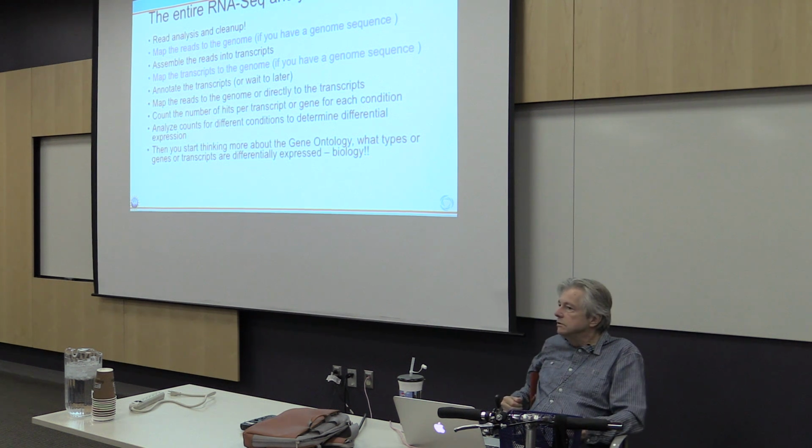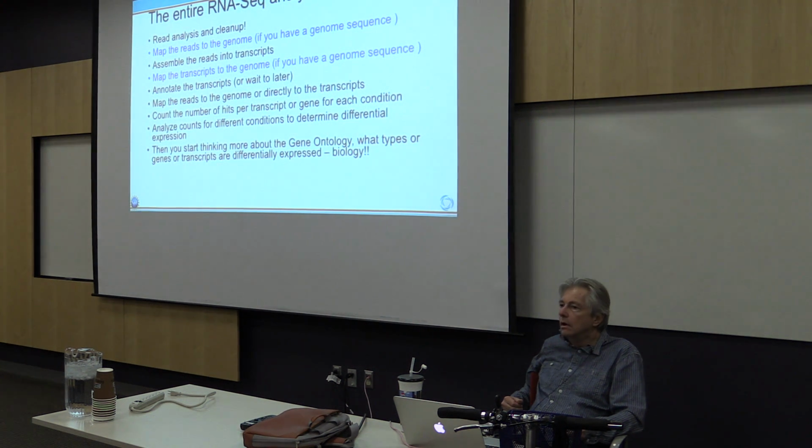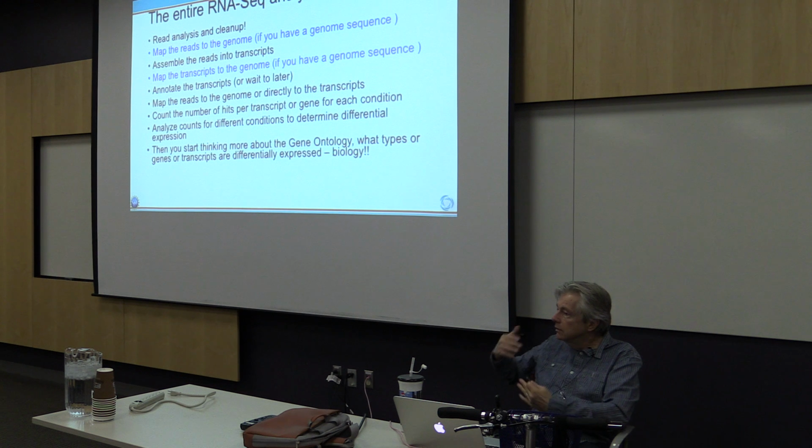But the information is sometimes really weak. And if the signal is really low, then it can have misinformation. And you don't want that. Any misinformation ends up producing a lot of extra junk in your attempts to piece together your reads into transcripts.